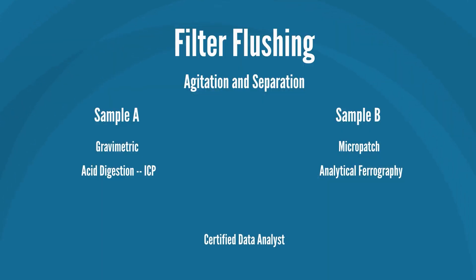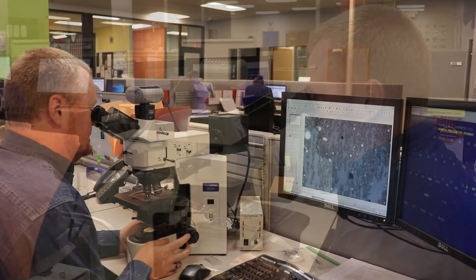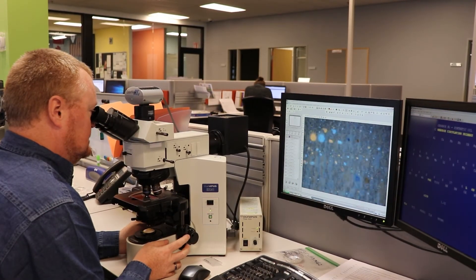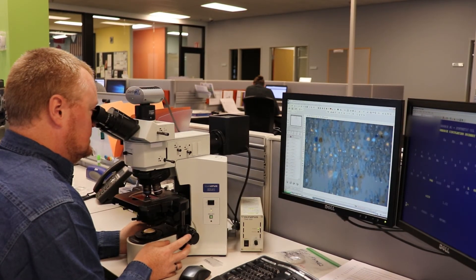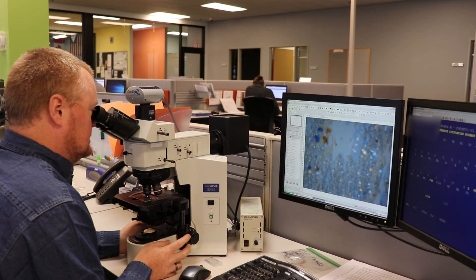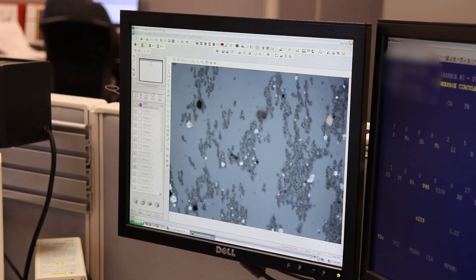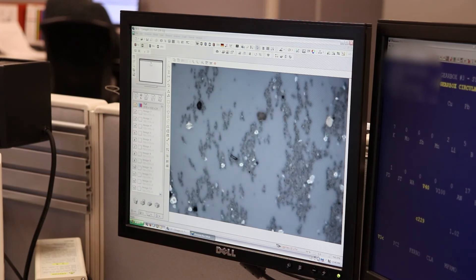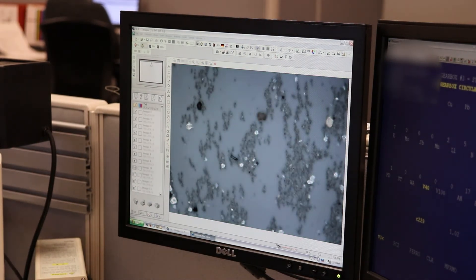The final step in filter debris analysis includes both sample A and B analyzed by a data analyst. This is conducted by placing the collected debris particles of the ferrogram and micropatch under a powerful microscope, and a certified data analyst studies it. The microscope captures images of the debris to determine type of wear and particle size, concentration and composition. Our data analysts then provide the results in a report along with suggested maintenance recommendations.